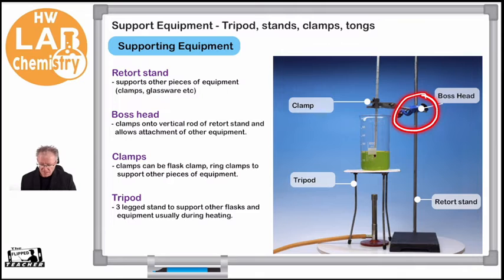We have a boss head. This boss head is a clamp that attaches to the rod, and we can move it up and down to change the height. We can add other pieces of equipment to the boss head — it's like a clamp that allows us to add other parts to our retort stand. Then we have different types of clamps. Here I've shown a generic clamp that I'm using to hold a thermometer while I heat some liquid, but it can also hold other pieces of glassware — a filter funnel, a condenser, and more.